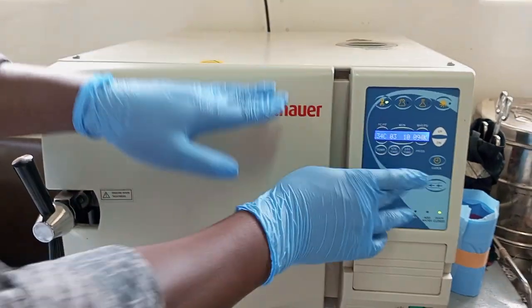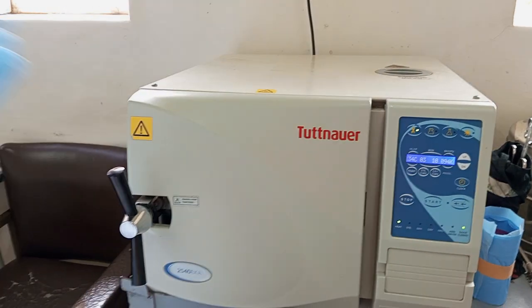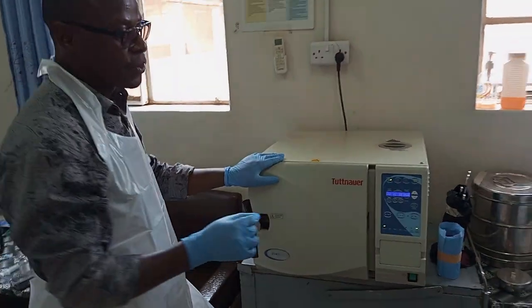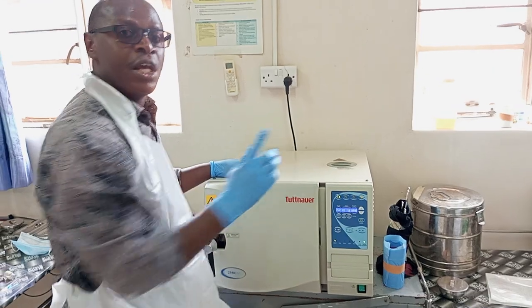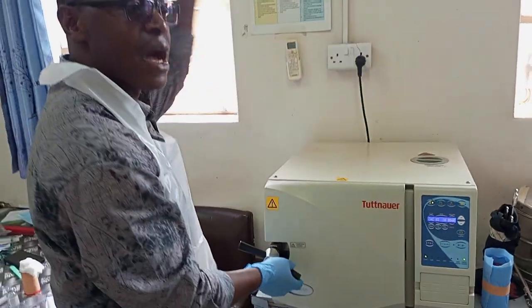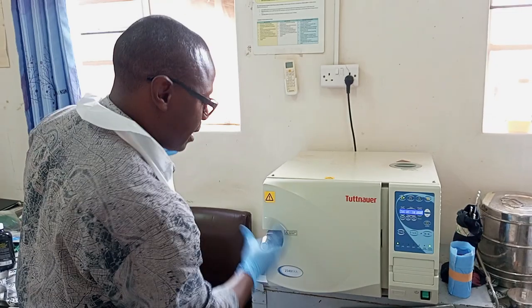So after pressing the button for starting, your work is done. You just have to sit and wait until you hear the hissing sound. After you hear the hissing sound, you come and check, you find the word finish written, meaning the cycle has been finished. Your next step is simply to come and open, because all the steam has been drained out and the drying process is done.